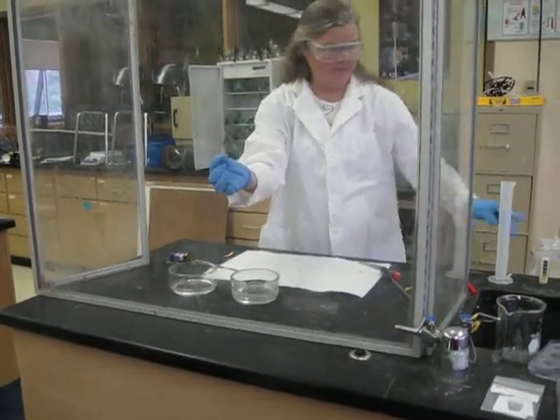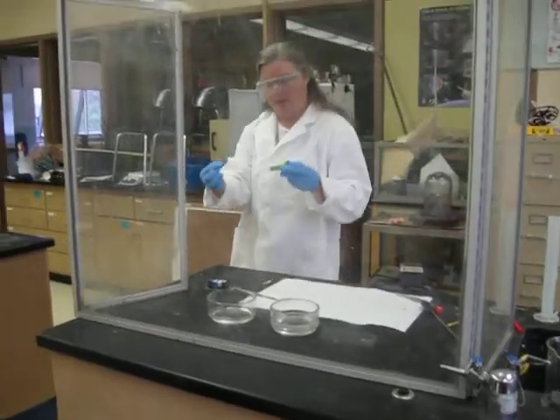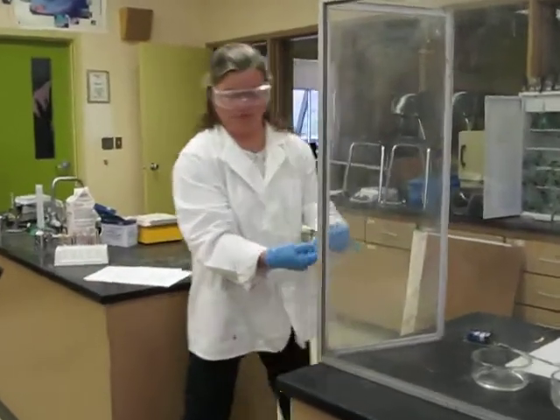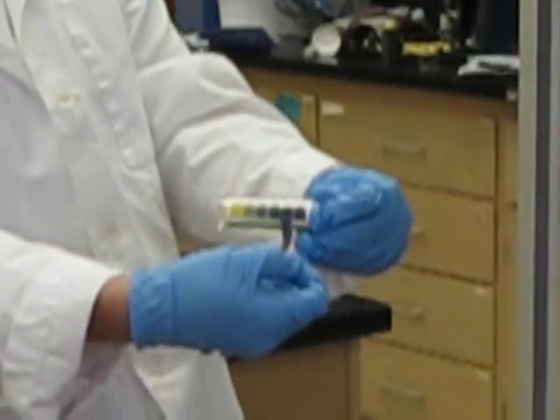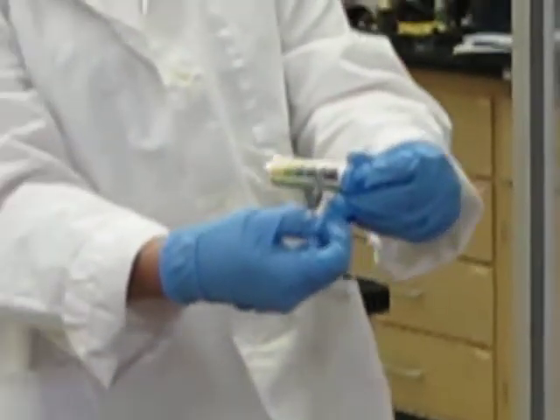All right, now, here's our pH paper. What happened to our color? It was a 6, and now what is it? It's an 11. Okay, so we went from a 6 to an 11 in pH.